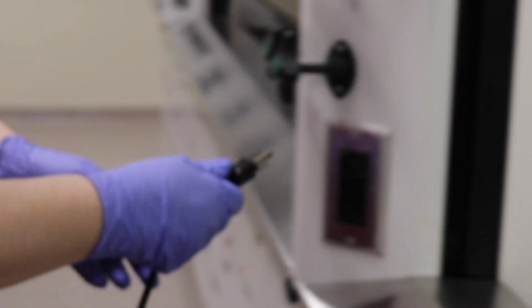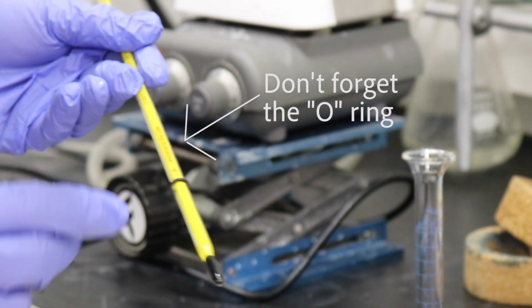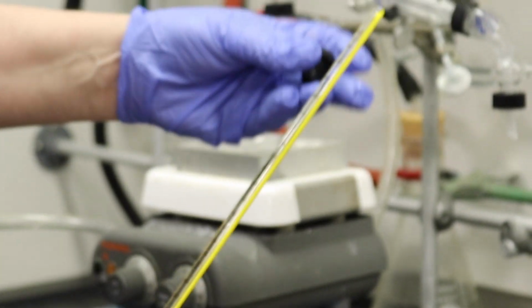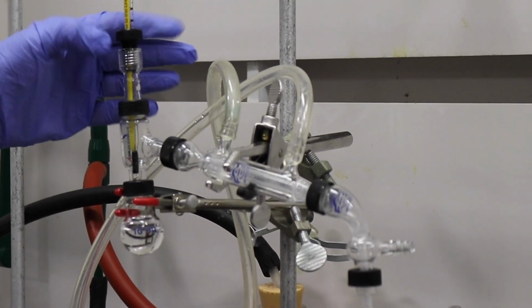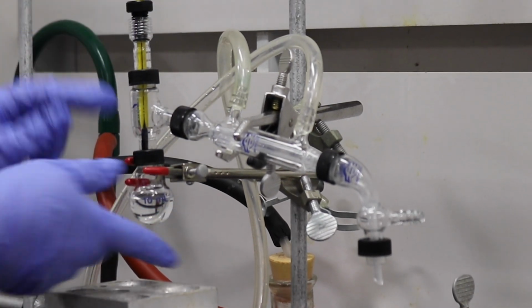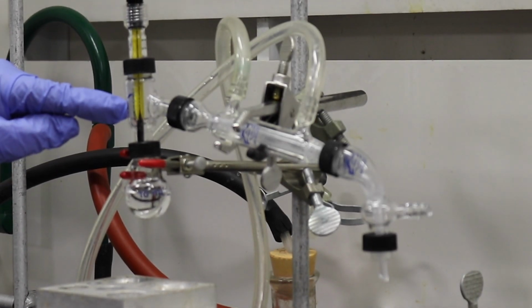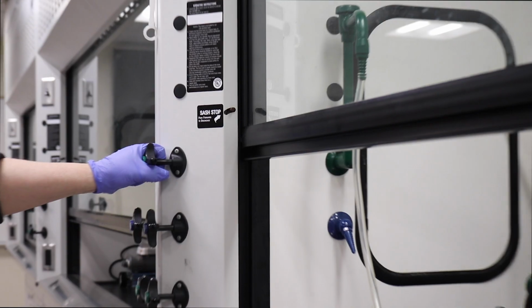Then we have to plug our hot plate in. We don't forget the O-ring on the thermometer. We have to put the thermometer into our system. Now we're putting the adapter on top. We are now going to screw in our thermometer, making sure that the bulb is at the right point. As you can see here, we're pushing it down just below, to make sure that it's at the right point so we can heat evenly and actually get the correct temperature.